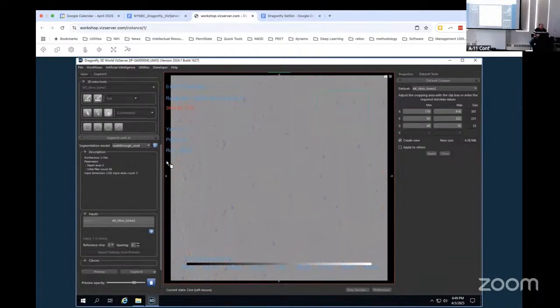You may have moved after. Okay, we're at 40. I wonder if this needs to be 46. Maybe it's because we reversed or something. Let me check that. No, that didn't help.